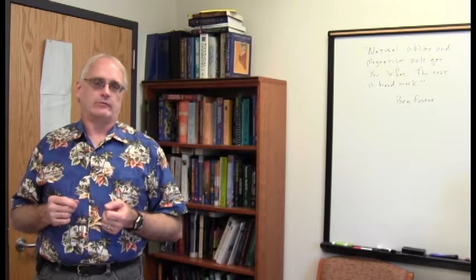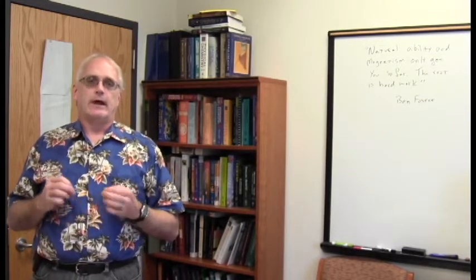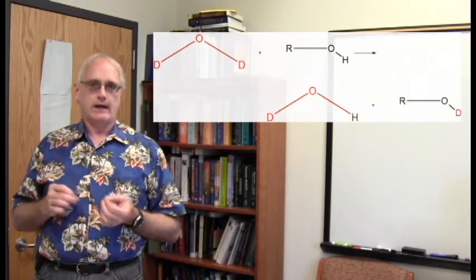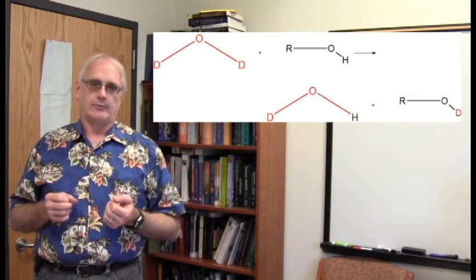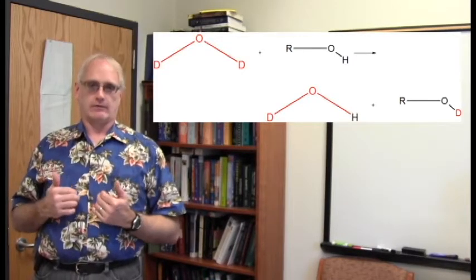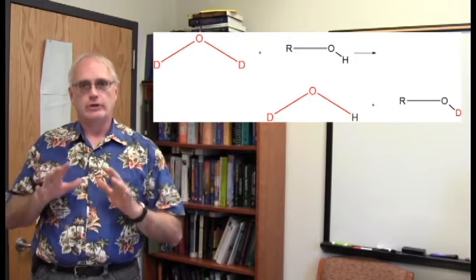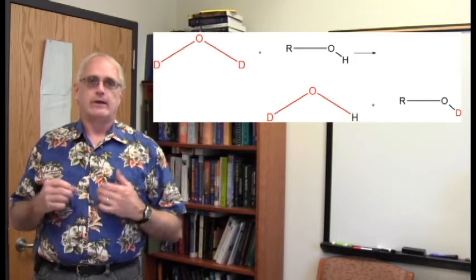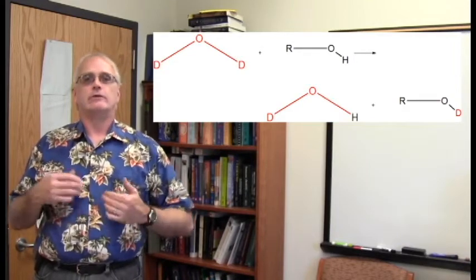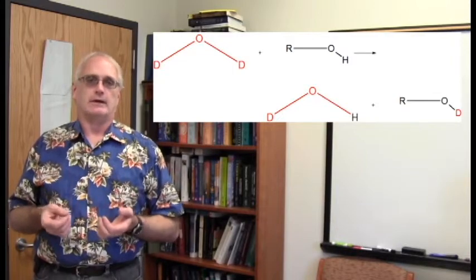What will happen is this hydrogen exchange reaction will now take place, but with deuterium. And so you expect to see any heteroatom hydrogens in your proton NMR sample either vanish or certainly shrink in magnitude, mainly because now instead of hydrogens, you are exchanging deuteriums in your molecule.